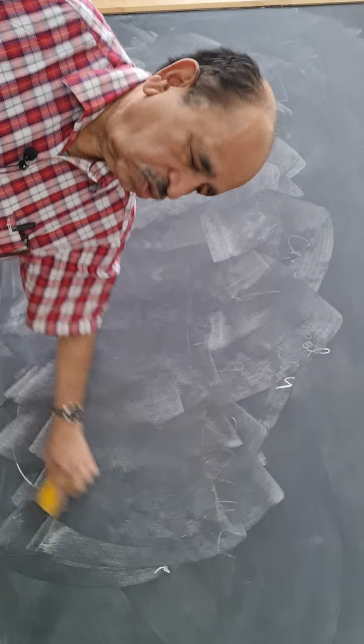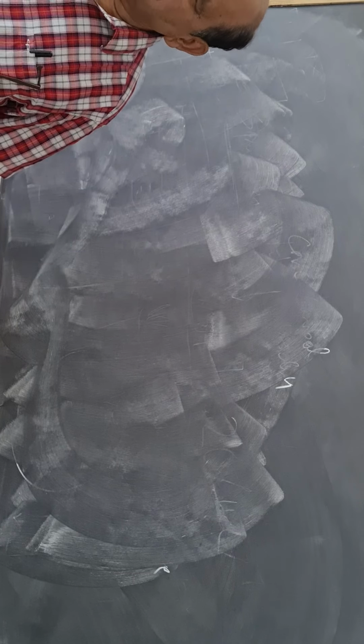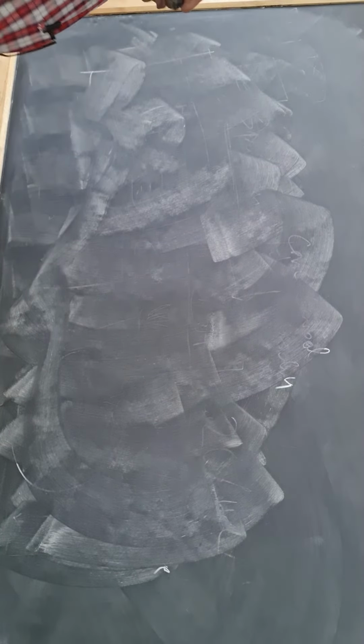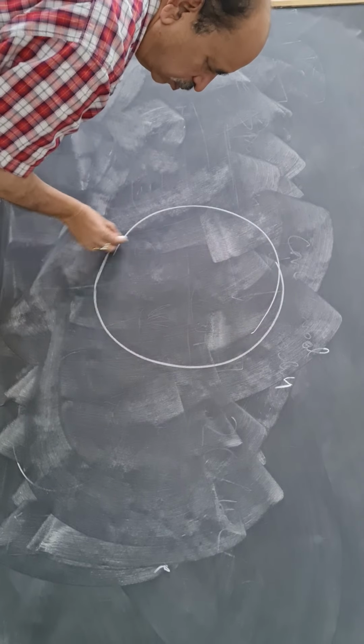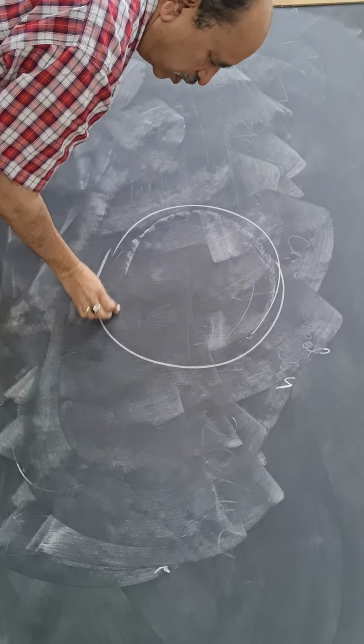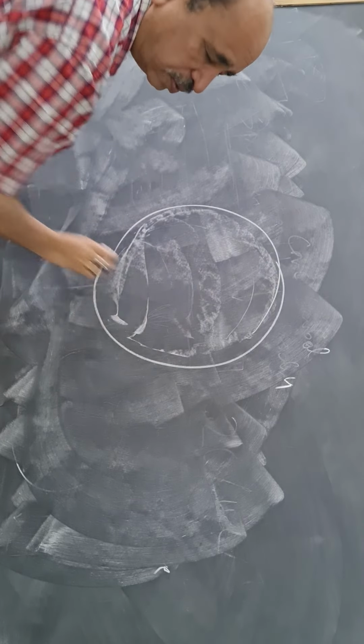Once under the microscope, you have to adjust to the oil immersion 100x objective. Put the oil on the smear, touch the 100x objective to the oil and bring it up until you see a faint image. With fine adjustment, you adjust until you see the bacilli. Then you draw the diagram. The background should be blue in color.